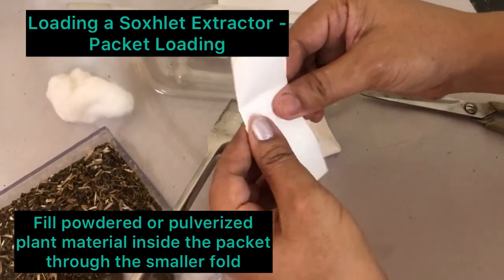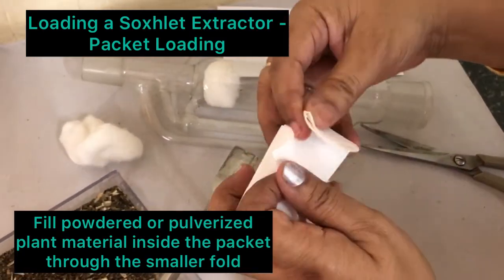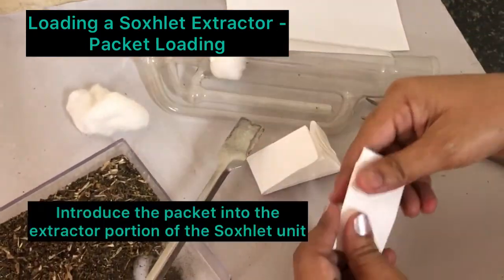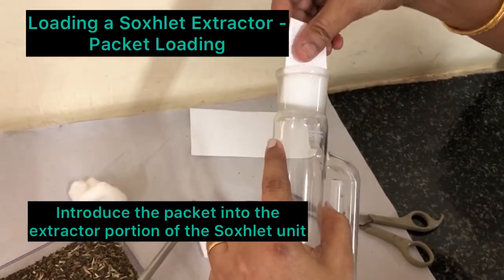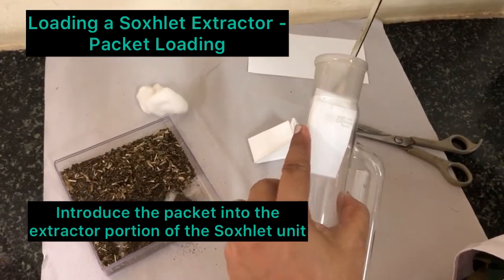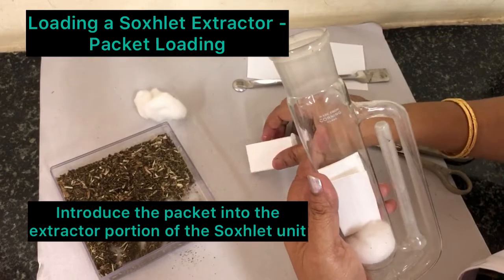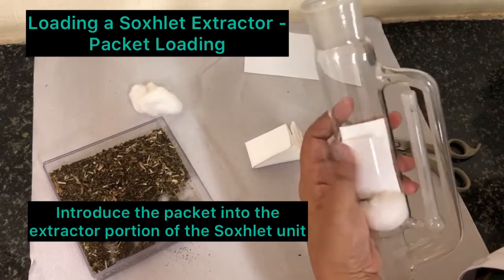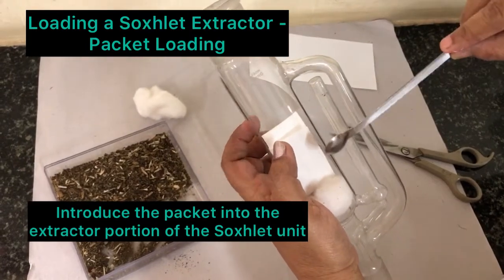As much as it fills inside this cavity, you can fold it back so that it completely makes a packet. Then take this, plug in cotton, and then push it inside like this. You can see that the larger fold is facing downwards, and the smaller fold is closing it.